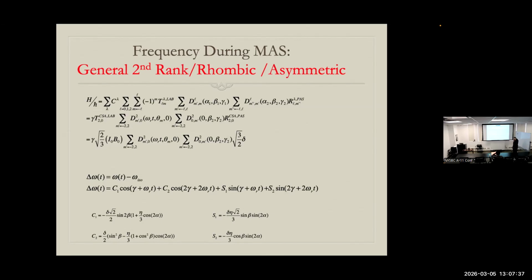Then it only takes about 100 objects to span the spectrum. So 1,000 should be sort of okay sampled, and 10,000 should be well sampled, right? But actually, there are algorithms that are smart where you realize the top half of the sphere is the same as the bottom half, and other things like that, so that with a couple of 100 crystallites, you sample things of interest in MAS.